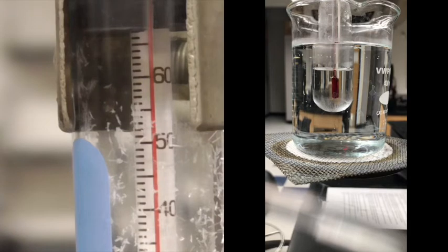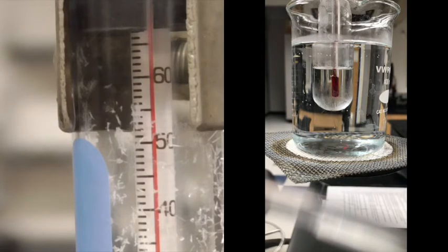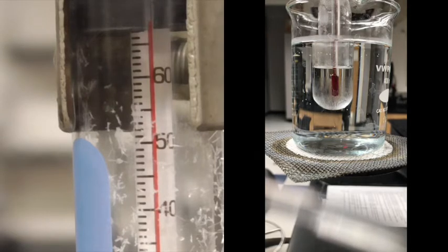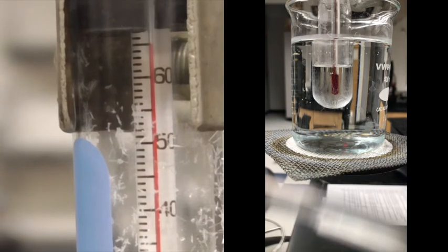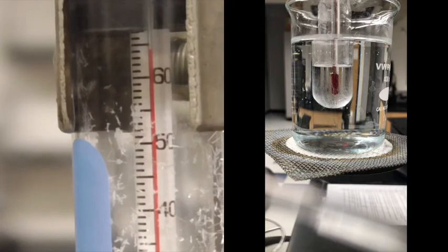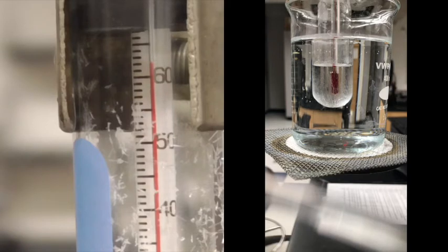Alright, so you can see it's still above 65. Here it comes. All right. 65. Start taking. All right. So every 30 seconds.